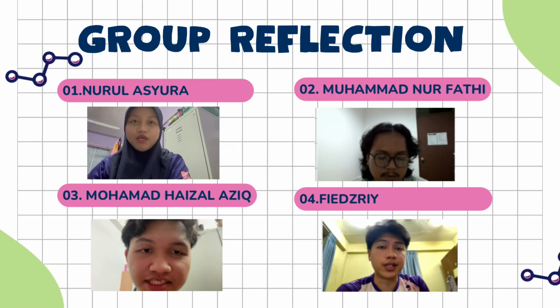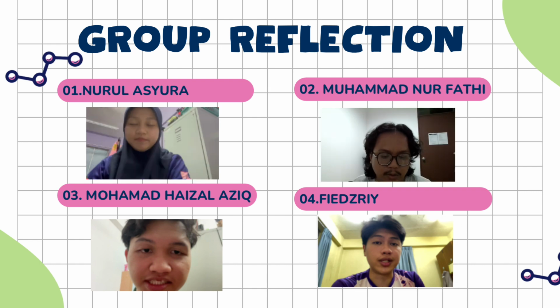From this experiment, we learned how to use a spectrophotometer to measure absorbance and understand the relationship between absorbance and protein concentration using the Beer-Lambert law. We also improved our skills in preparing standard solutions, performing accurate pipetting, and analyzing data using the calibration curve to determine the unknown concentration. As for challenges, one was the consistency of the results.